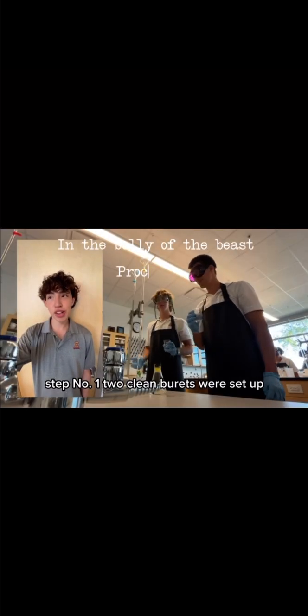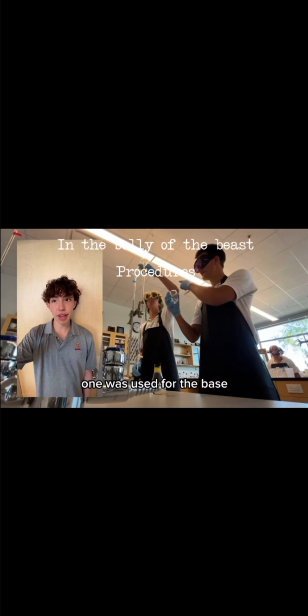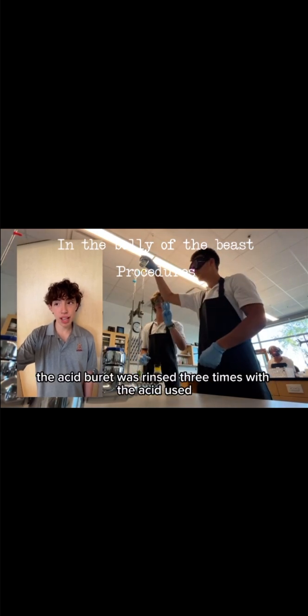Step number 1. Two clean burettes were set up. One was used for the acid, one was used for the base. The acid burette was rinsed 3 times with the acid used. Same was done with the base.